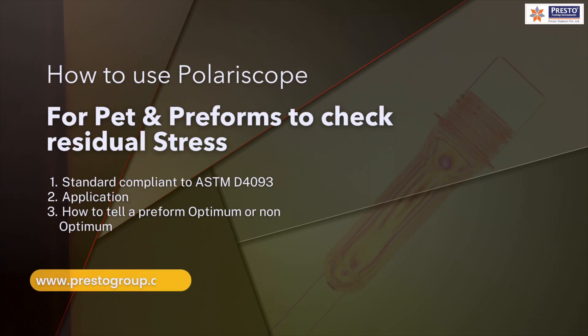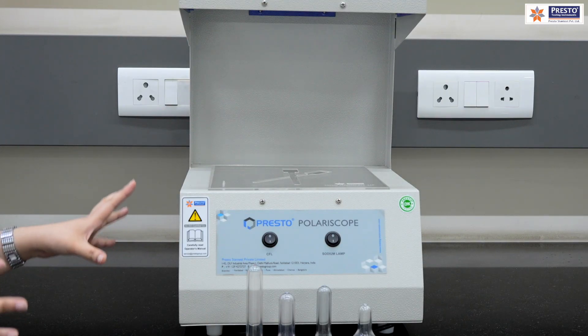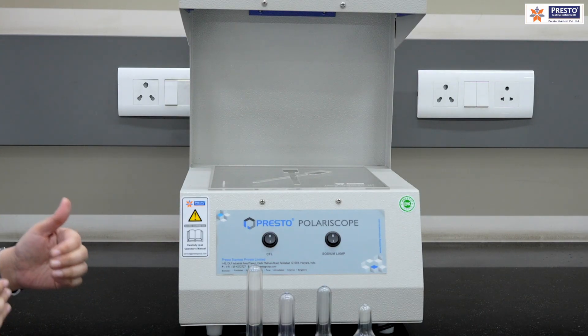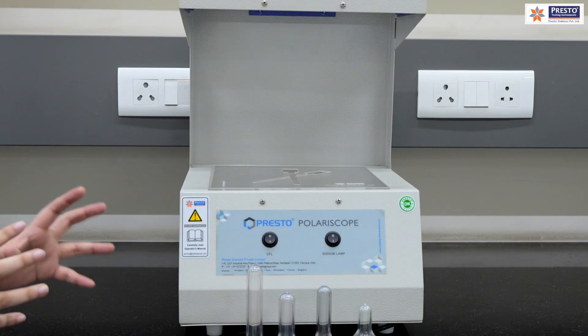Today we will be discussing about a very important instrument — the polariscope — which is very useful for the PET and preform industries. The polariscope we will look at today is mainly for PET sheets, PET bottles, and preforms.